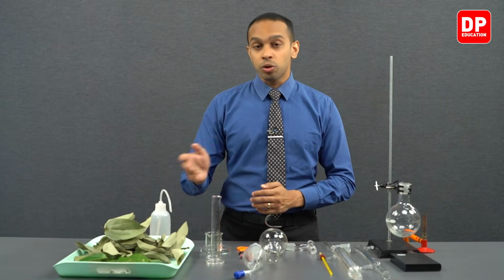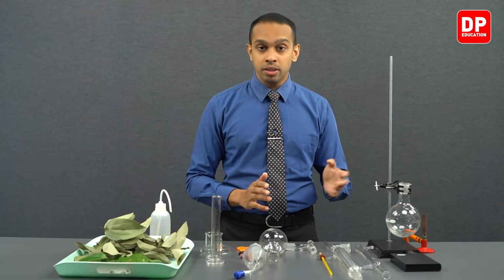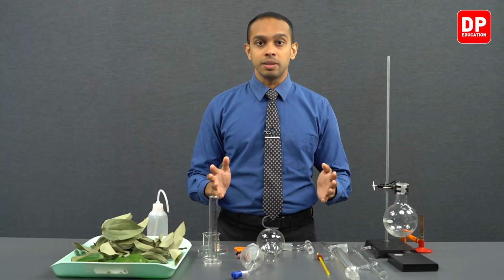And the aim of this experiment is to develop the skills required for extraction of essential oils from selected natural resources. Let's move on to identifying the equipment and the chemicals we will be using for this experiment. Let's identify the raw material and the equipment we will be using.